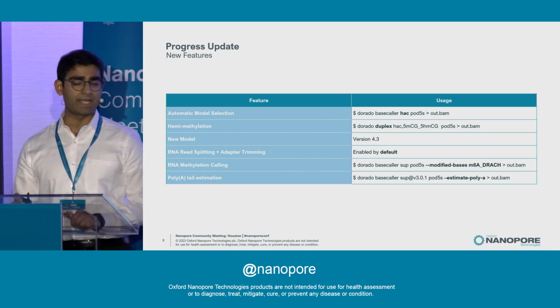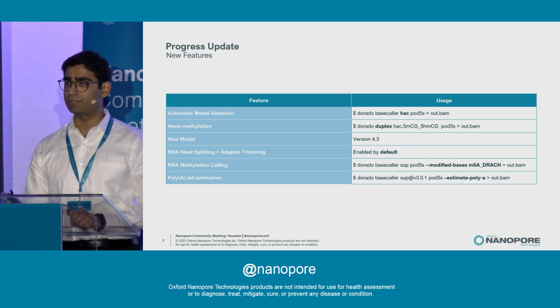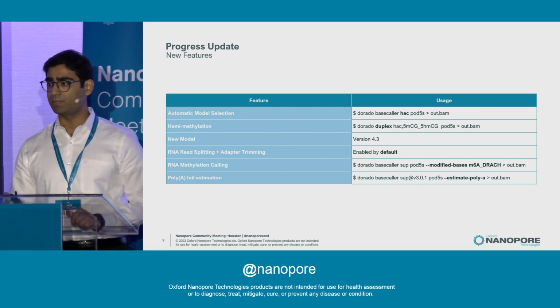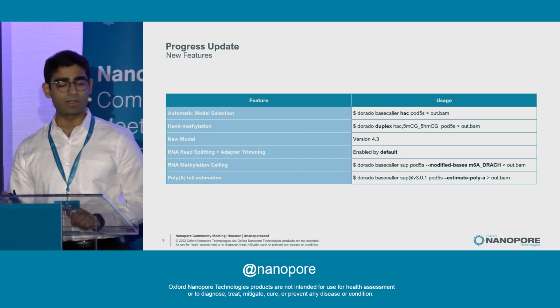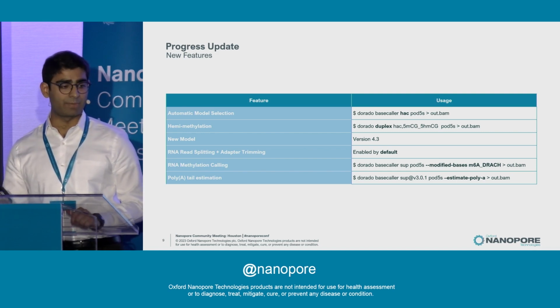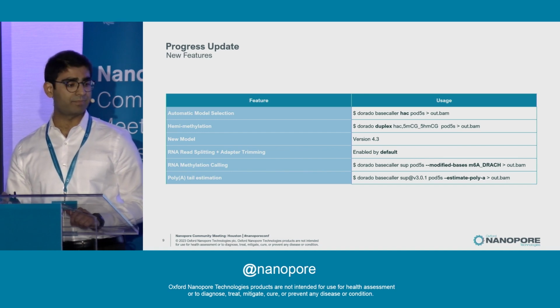We've also released hemimethylation support, which is a new feature for Dorado Duplex. With that, you can now mod base call both strands of a DNA molecule simultaneously. My colleague Marcus will be talking more about this in his upcoming talk. We're also releasing a new simplex model, and I'll be talking more about that in the next couple of slides.